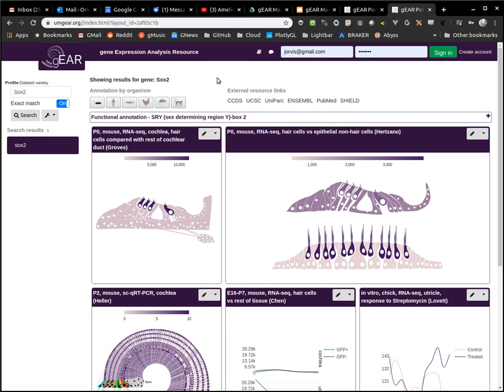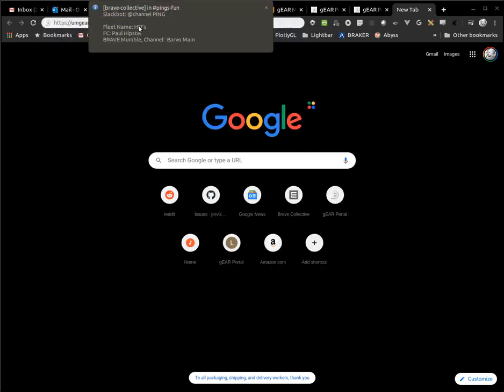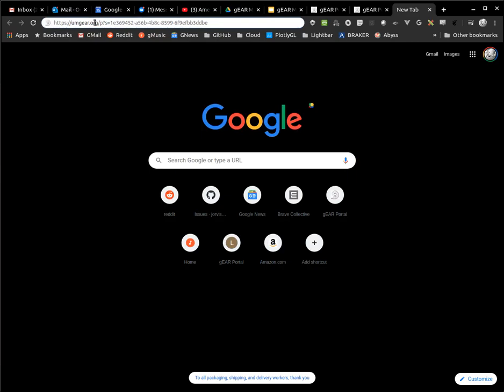Now, there's also permalinks to individual data sets. They're a little bit longer. In either case, you'll just be copying and pasting them, but it looks like this. So it gives you the permalink and then to a specific dataset share.